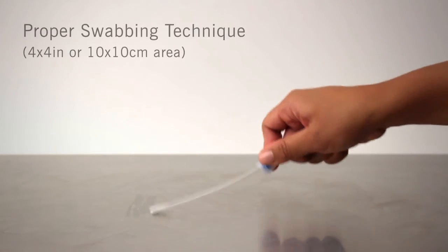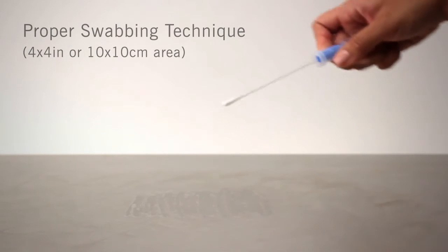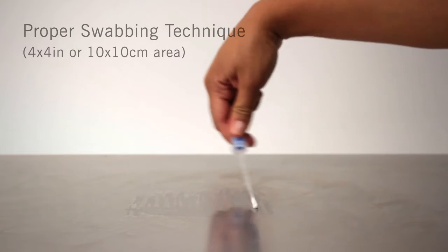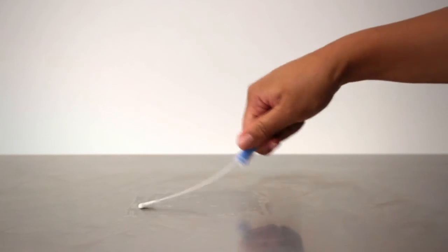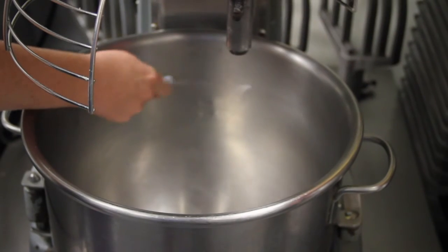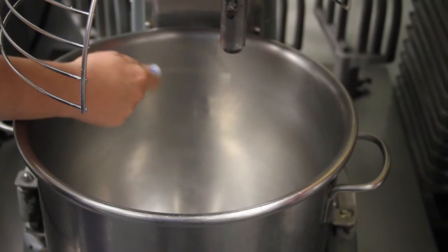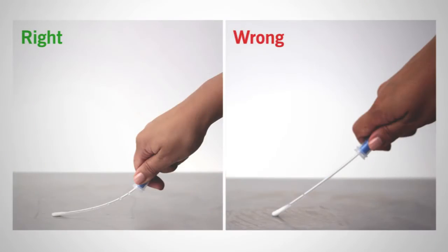Twist and pull the swab out of the tube. Swab a 4x4 inch or 10x10 cm square area in a criss-cross pattern, swabbing the area with even coverage. When swabbing an irregular surface, ensure the swabbing technique remains consistent and swab a large enough area to collect a representative sample.